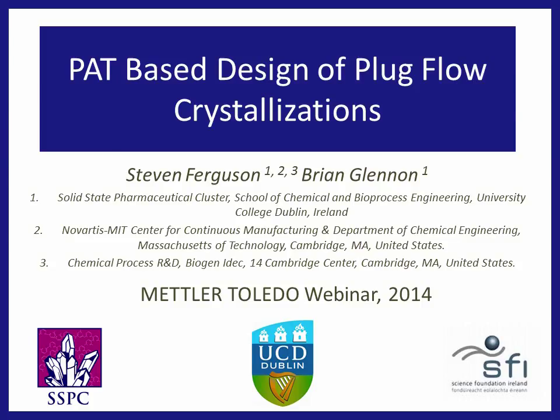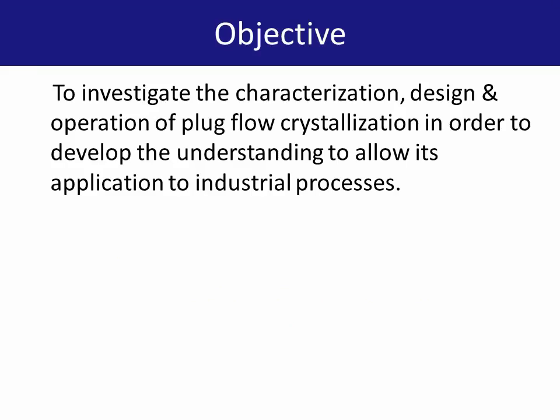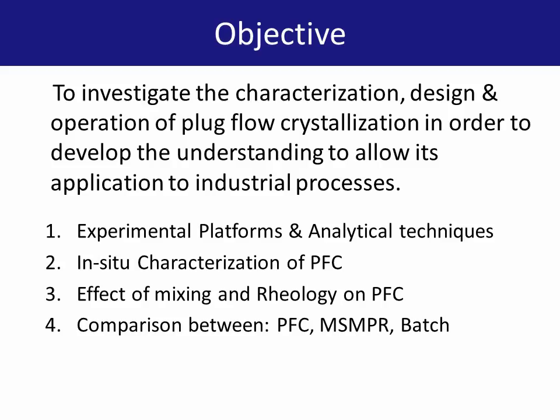So, the central objective of this work was to investigate the characterization, design and operation of plug flow crystallization in order to develop the required understanding to allow its application to industrial processes. In order to realize this objective, I went through the following steps, which I will go through sequentially over the course of the presentation. So firstly, I developed a plug flow crystallization platform and associated in situ measurement techniques.